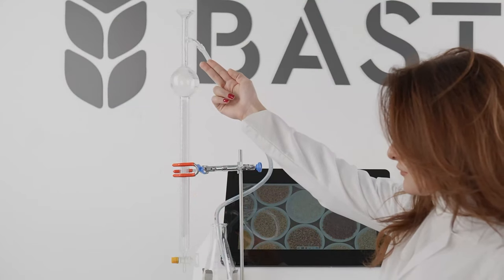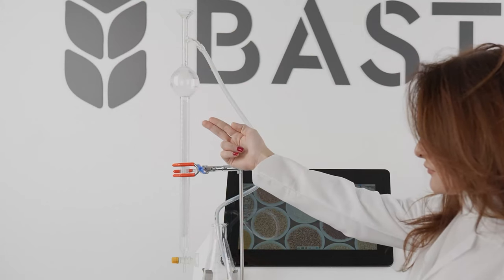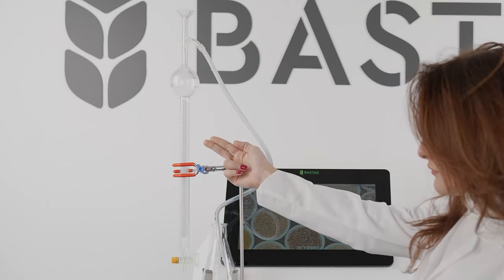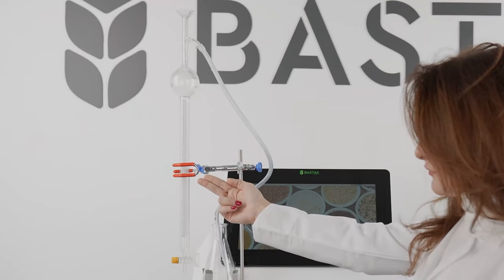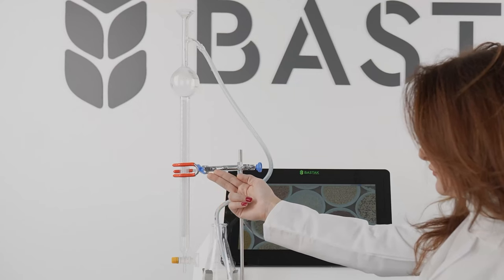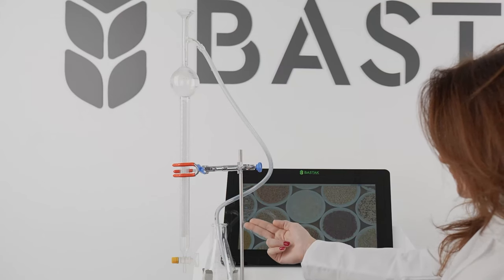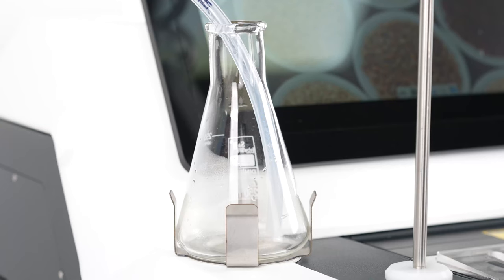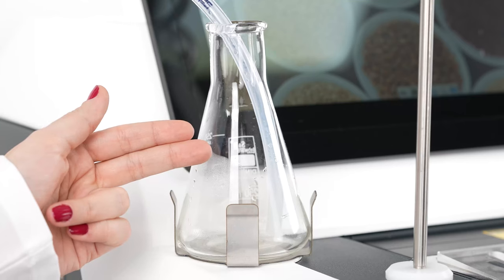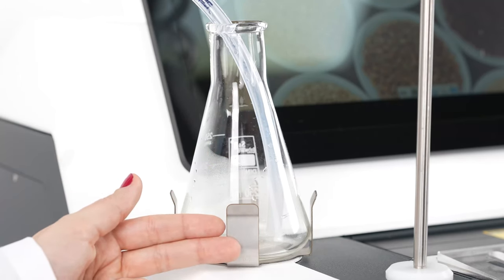The burette ensures that the pure water required for the analysis is delivered to the sample. The burette slot is the part where the burette is placed, and the burette holder is the stainless steel rod to which it is connected. The Erlenmeyer is the glass container where excess water from the burette is discharged, and it is placed in the burette holder reservoir.